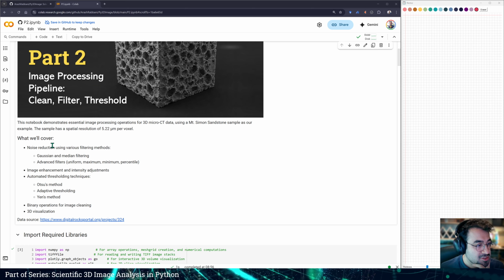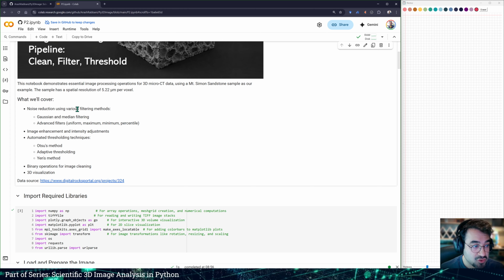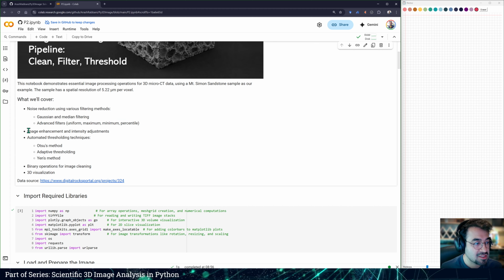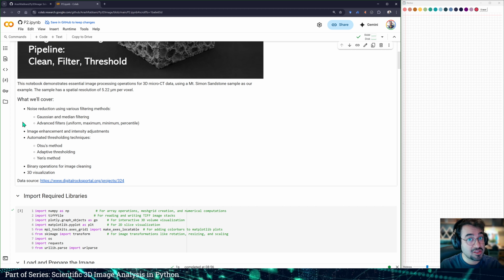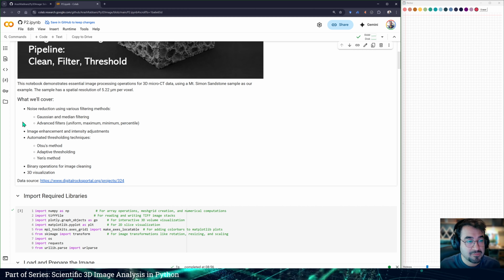So let's start by going through the different things that we are going to cover. First we're going to talk a little bit about noise reduction. What are the different techniques? We're going to talk about some basic and famous techniques and some more advanced or unconventional techniques, and keep in mind that these filterings are being done in 3 dimensions, so it's a little bit different from 2D filtering, both in terms of the amount of computation it needs and the availability of algorithms.